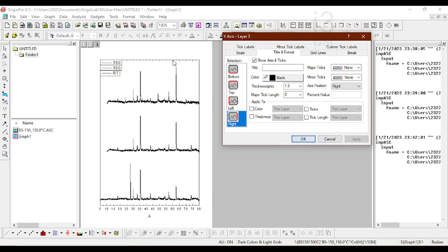For this graph we also have an upper axis, which is top. Previously it is in, so it is inside. Suppose you want to customize and make these lines go out, you can apply. You see the major ticks are out, minor ticks are in. If you want even the minor ticks to be out, you can do that. These are the customizable points. If you want it both inside and outside, it is in between, so it is on the axis. We can make only the minor ticks on the axis and major ticks above. These are small things you can customize according to the user's wishes.